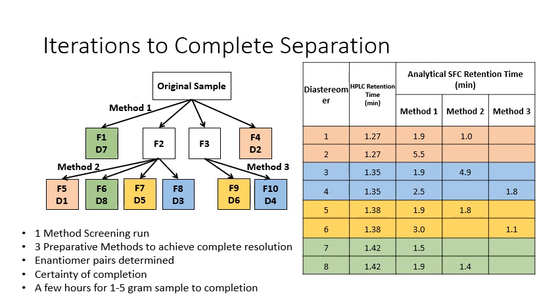Our final results are nicely expressed in this fraction tree. What you can see is that in no case did we need more than 2 chromatographic methods. In the first case, method 1 and then method 2. And then in the second case, method 1 and then method 3 to produce pure individual isomers. Based on HPLC retention time, we've got assignments of the pair relationships between fractions, knowing, for example, that fraction 1 and fraction 6 contain an enantiomer pair.